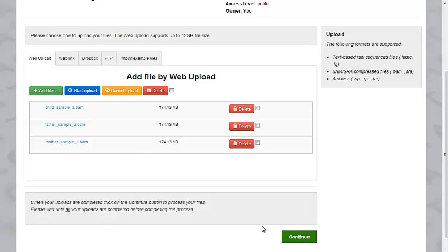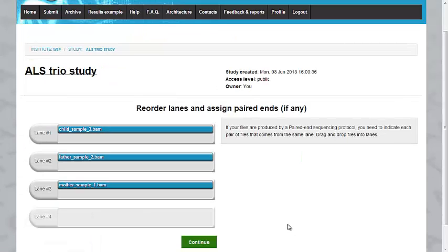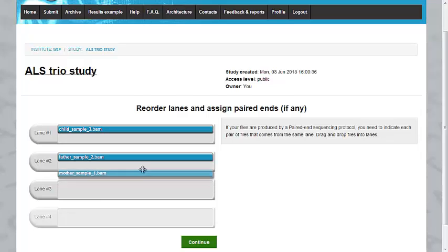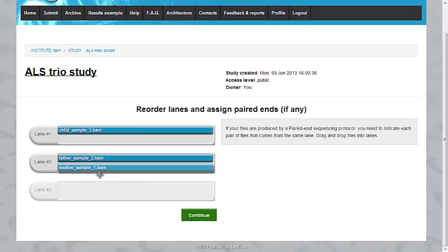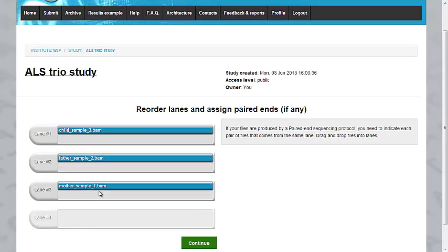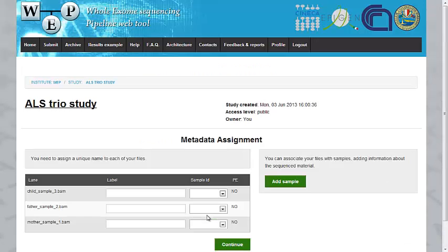After the upload is completed, just click on the Continue button. And if you need any reordering of any paired-end files, you just need to assign two files to the same lane. But it's not our case. So just assign one file for each lane and click on the Continue button. Next step is metadata assignment.